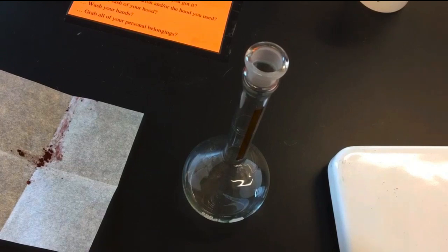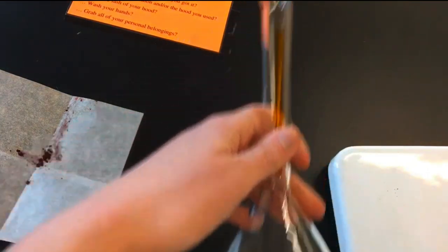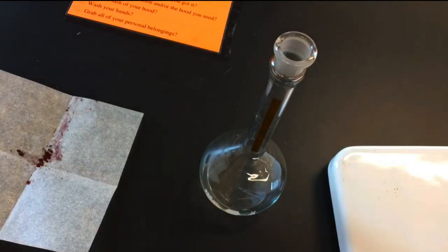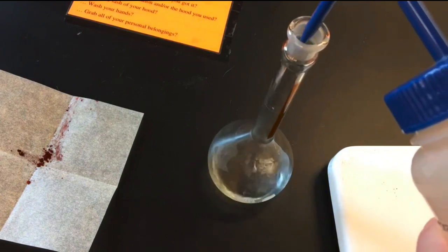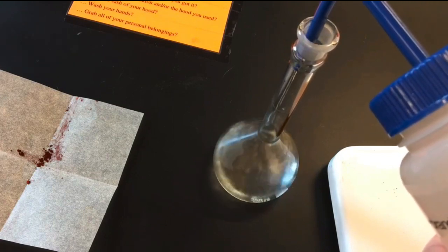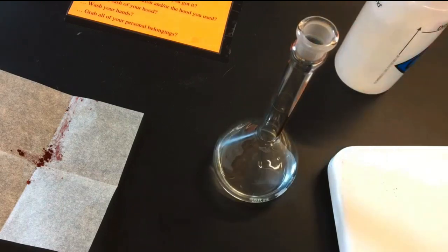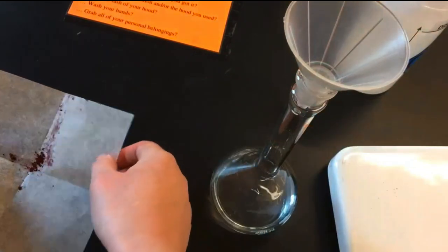All right, so now we're back at the bench. To make our stock solution, I have a 250 milliliter volumetric flask. We're going to start by adding a little bit of distilled water, so it's easier for this solid to dissolve. Let me take our funnel, to make sure it's easy for the powder to get in. So then we have our powder from the balance. Pour that in.